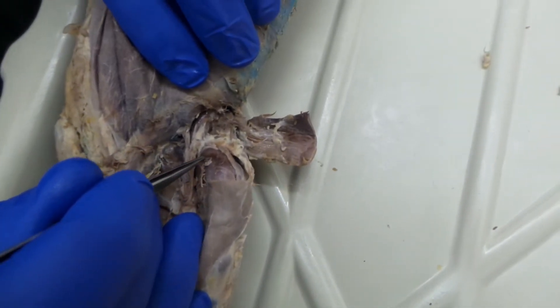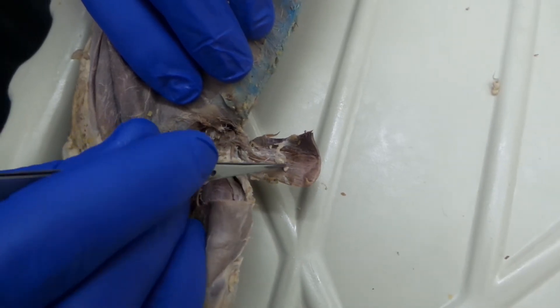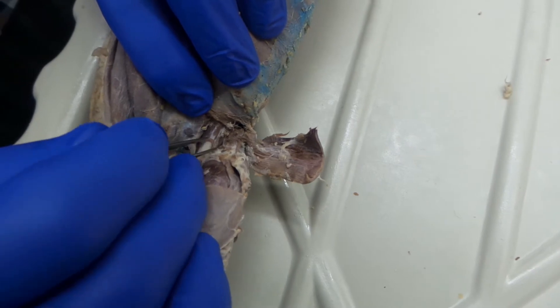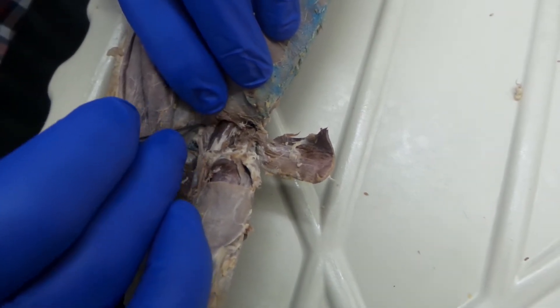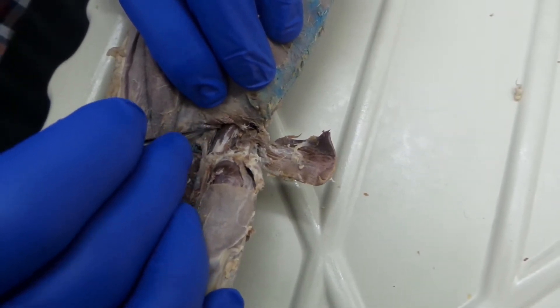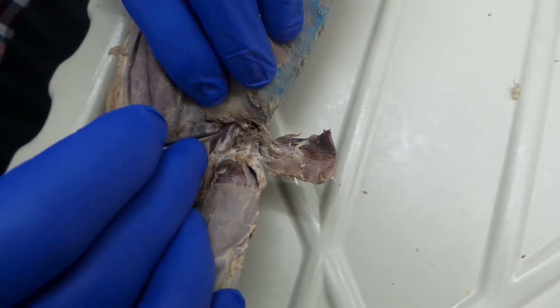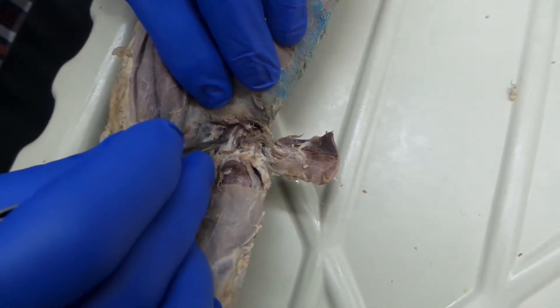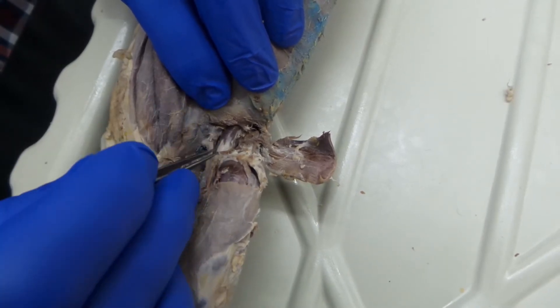Coming down a little bit deeper, if you follow those veins down, this is all sartorius. But right here coming out is a little fused muscle — this is the iliopsoas. In humans, there are two separate muscles: the iliacus and the psoas major. But in mink and in cat, it's fused as the iliopsoas.